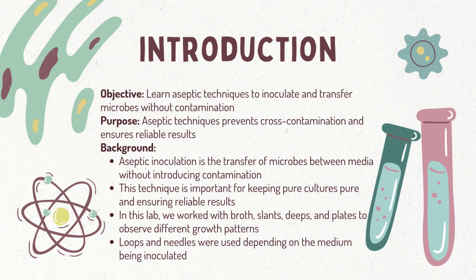In this lab, we worked with different types of media, including broths, slants, deeps, and plates, to see how bacteria grow in each environment. We also used different tools like loops and needles depending on the type of medium. Overall, this experiment gave us hands-on experience with aseptic technique and showed us why it is essential for studying and working with microorganisms.